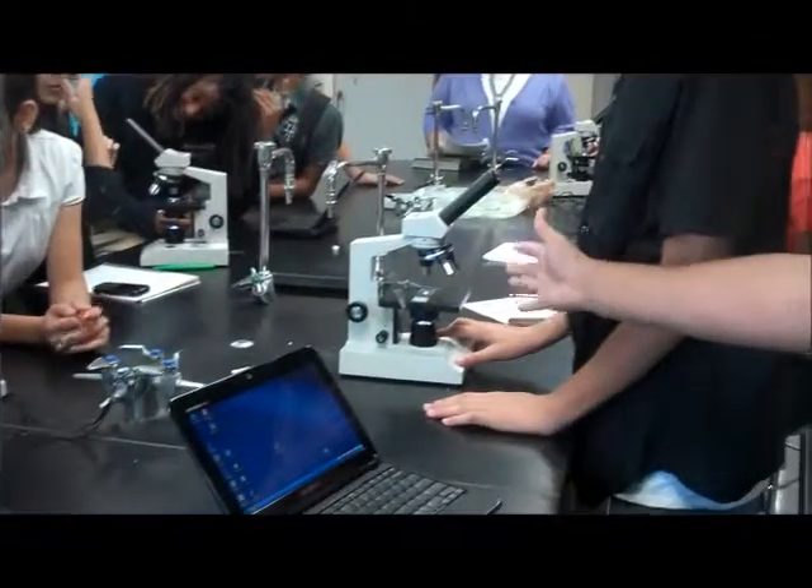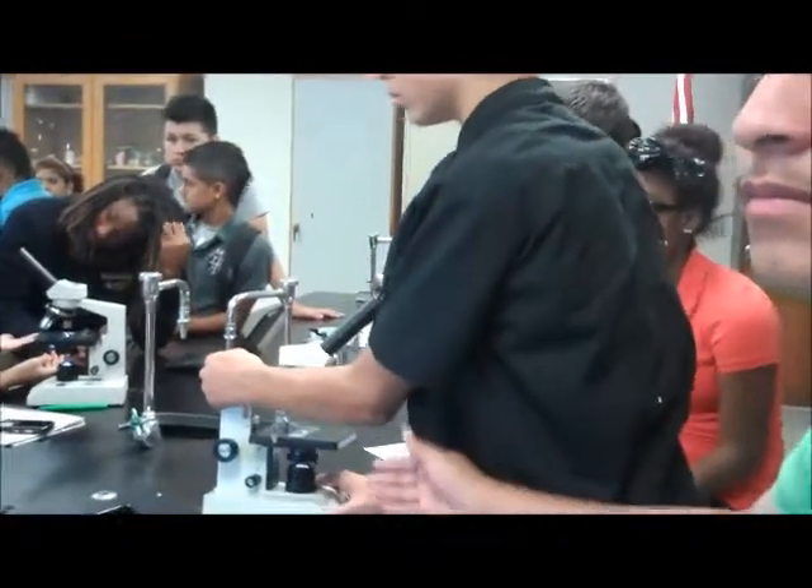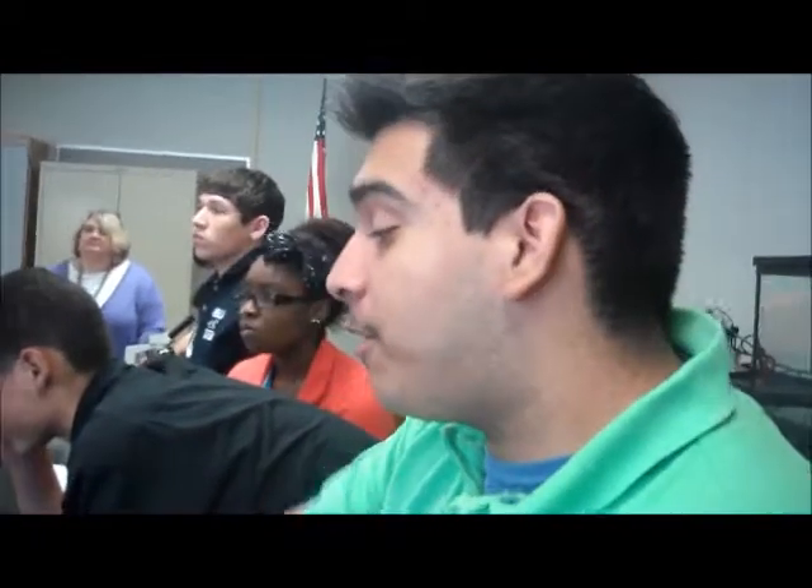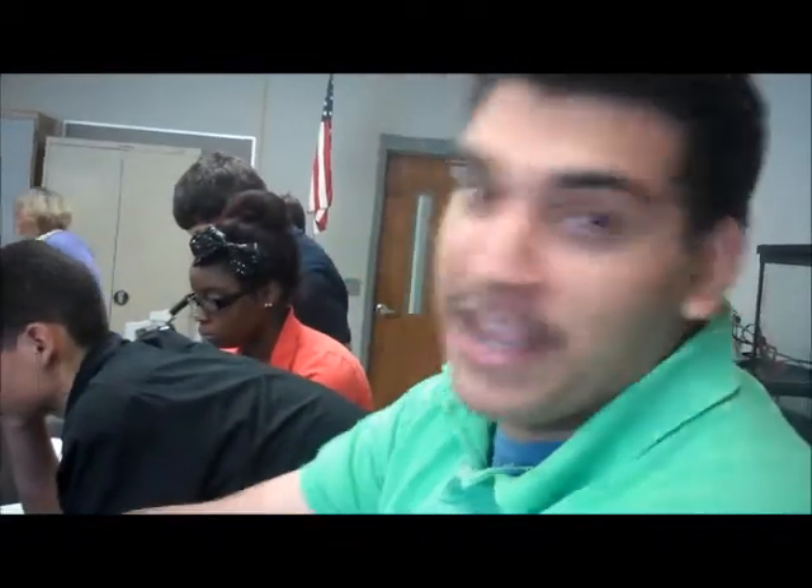We are trying to figure out how to work a microscope. We have to teach Mr. Taylor how to use one, because I think he's not smart enough to find out. Does he know how to use one? I guess not. We have to put steps, so that's why we have to make up steps, and we're going to get it off the internet.